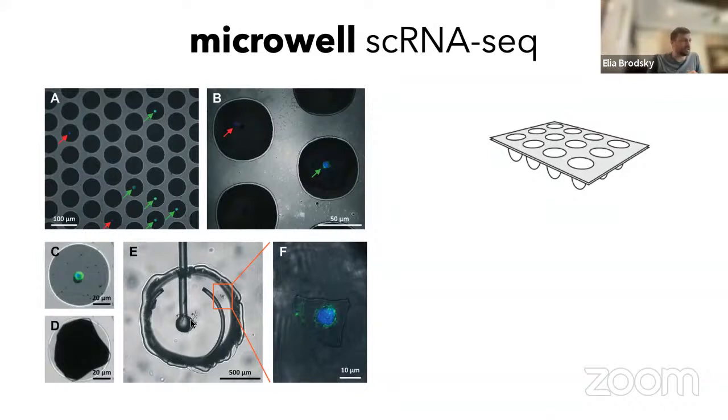optimized, and you can see in this case, this is that oil droplet, and here is that little cell, right? So that little cell right here, magnified over here, you can include additional phenotypic information. So essentially, in this case, you can make different color fluorescence, and you can potentially identify an additional aspect just to give you a control, right?